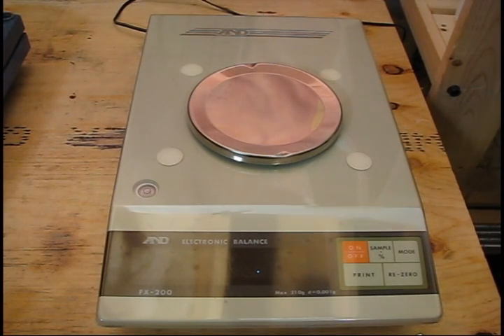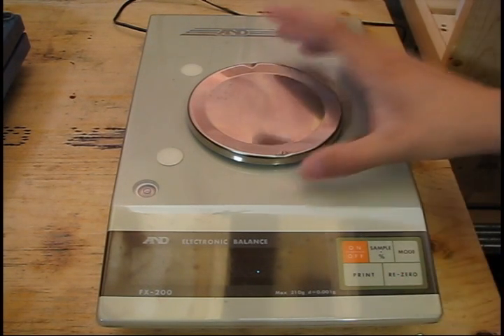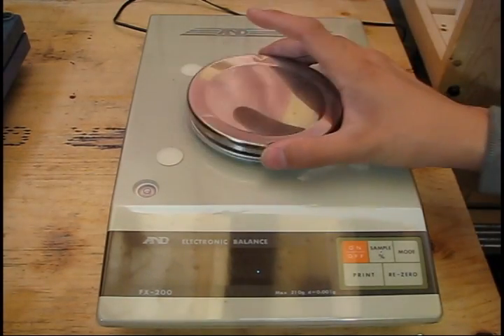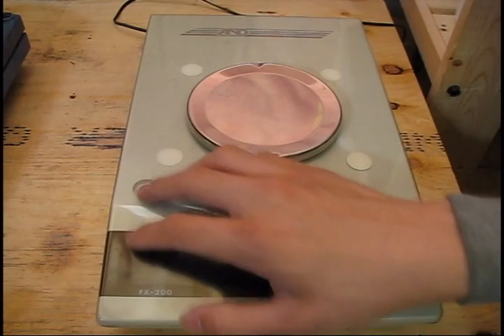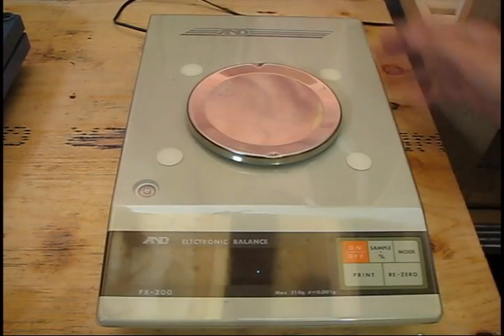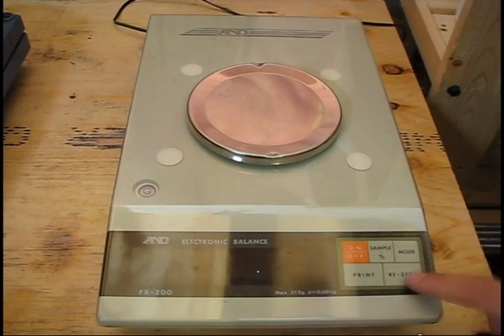First off, I just want to quickly show how to use a balance for those that don't know. All balances will have similar features: a power button, a mode button to determine the units, as well as a zero or tare — that's T-A-R-E — button which zeroes the scale, as well as the actual scale pan itself with a removable tray for cleaning. Some have dust covers. All of them will have this little leveling bubble, either in the front or the back, and sometimes a calibration switch.